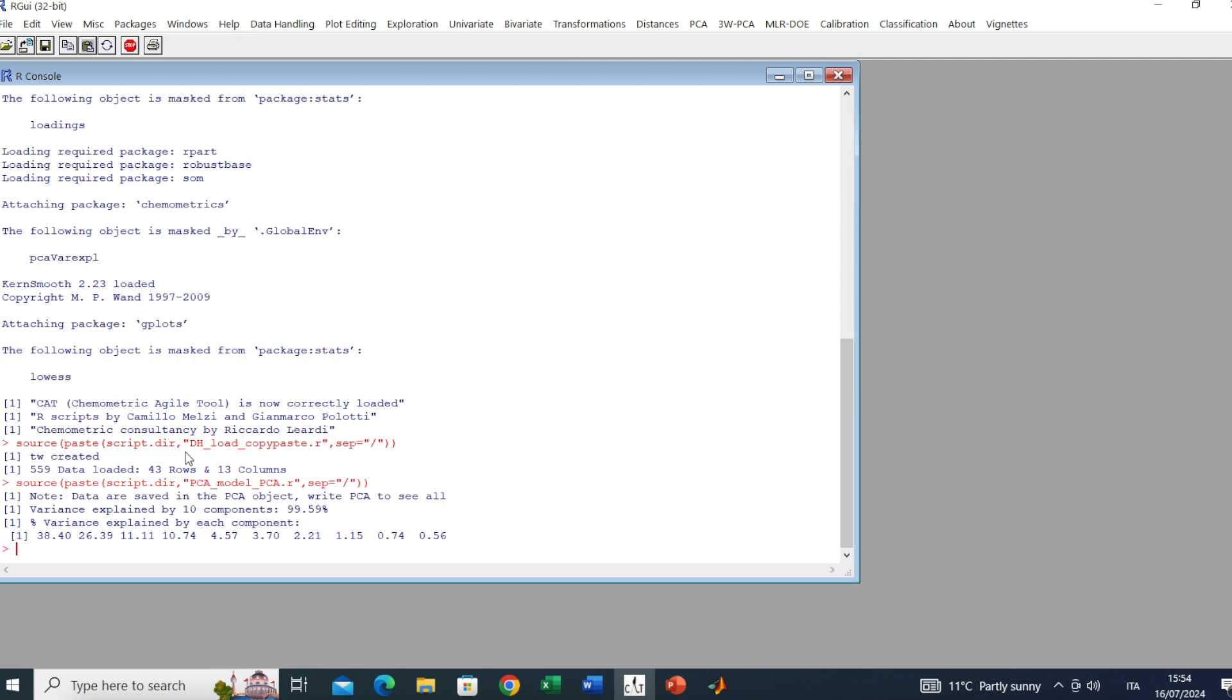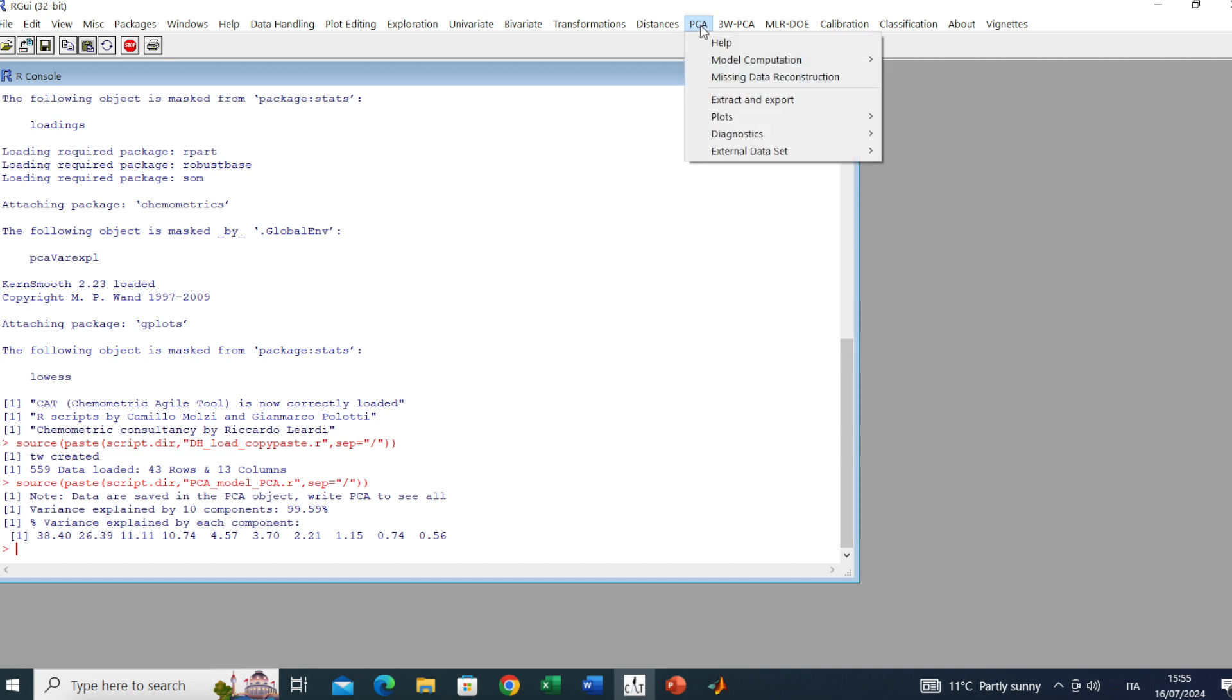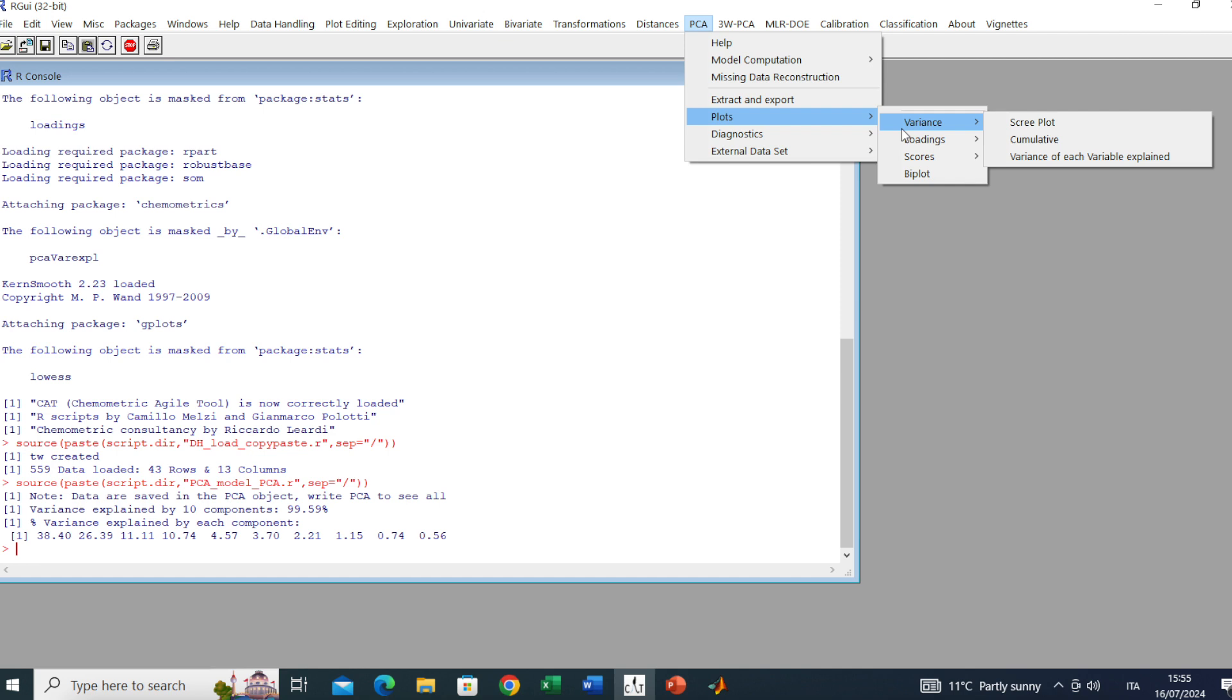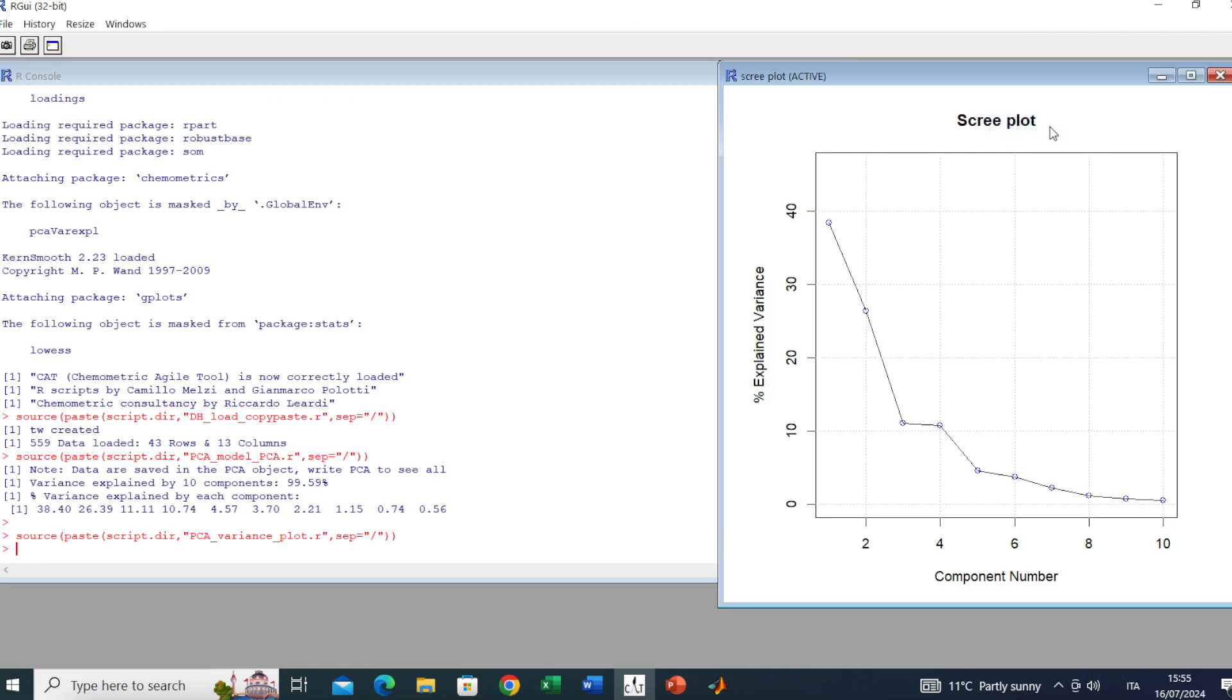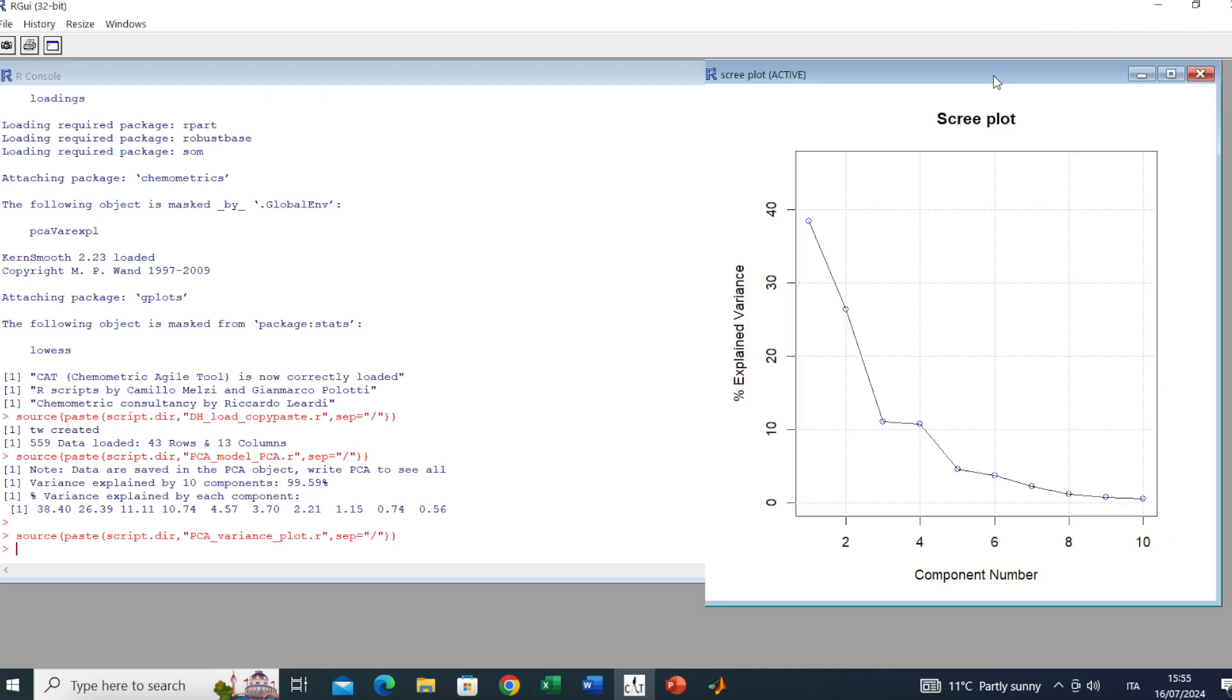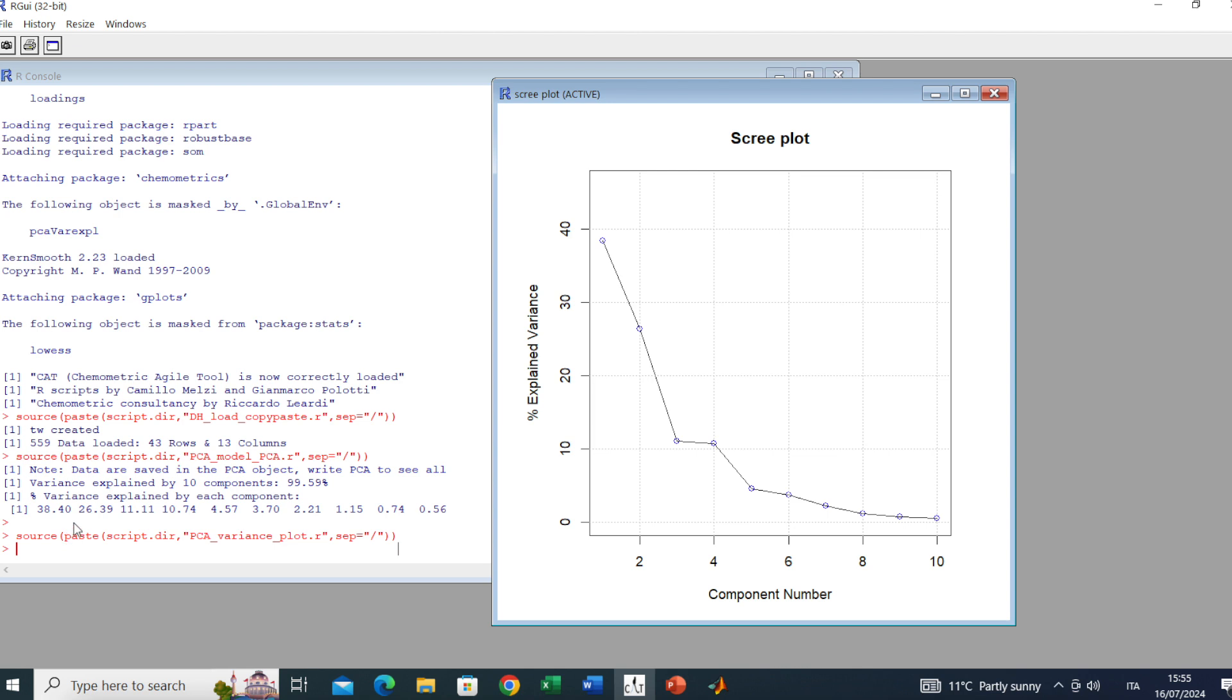Here we have done our PCA and we can see by looking at the console the variance explained by each component. In this case 10, since we have computed 10 components. Now it's possible to look at all the plots in the PCA menu. First of all, let's look at the scree plot. Go to Plot Variance, Scree Plot. Here we are looking at these percentages in a plot. It is quite important because it tells how many significant components we have. In this case two, according to the broken stick rule.